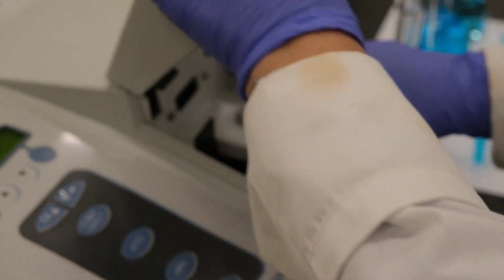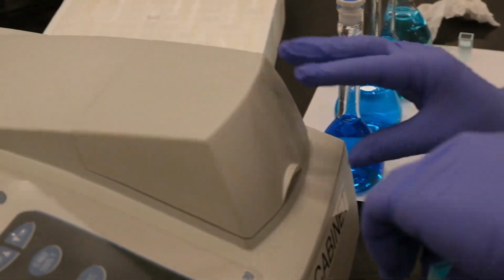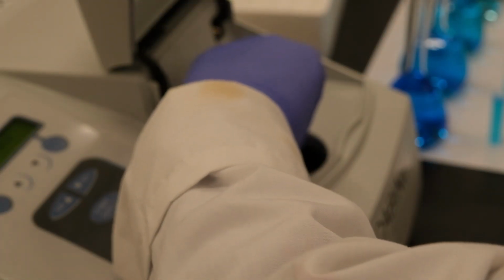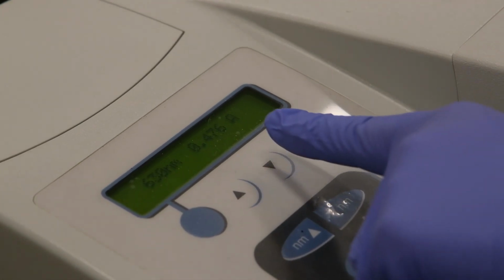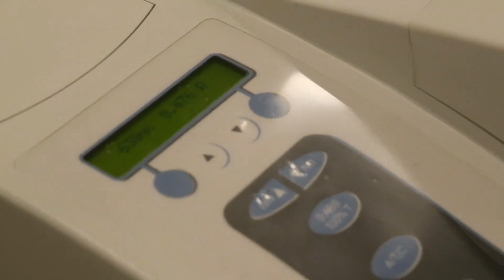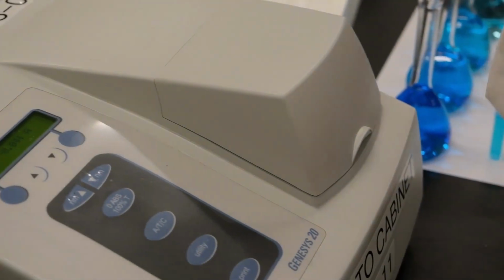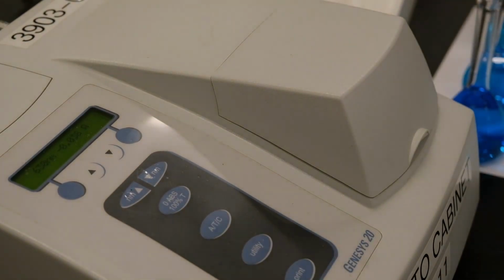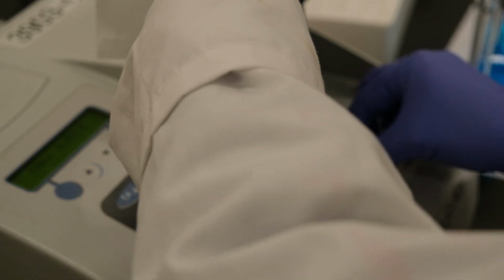We tare again this instrument, and then this was our middle solution, the 3 milliliter solution that we used as a reference for the absorbance that we needed. Calibrate again in between the measurements.